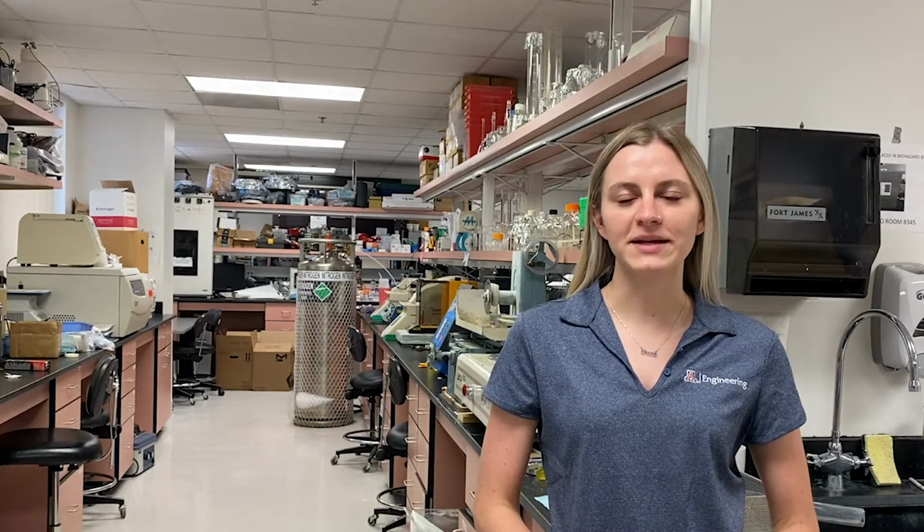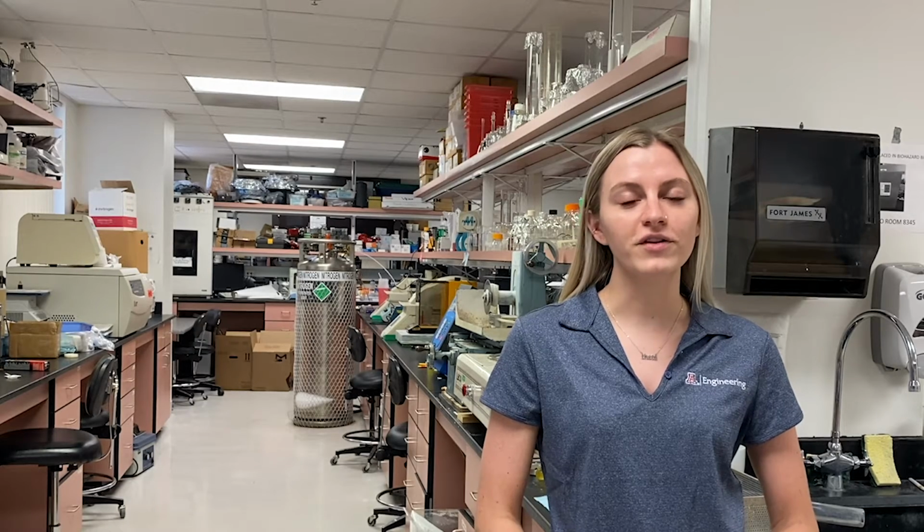In designing our system, we aim to meet all of our system requirements and to create a low-cost system that would be easily reproducible should any of the components need replacing. Therefore, the majority of our custom system components are 3D printed. Furthermore, the system is easily disassembled for sterilization and fits within the incubator environment.